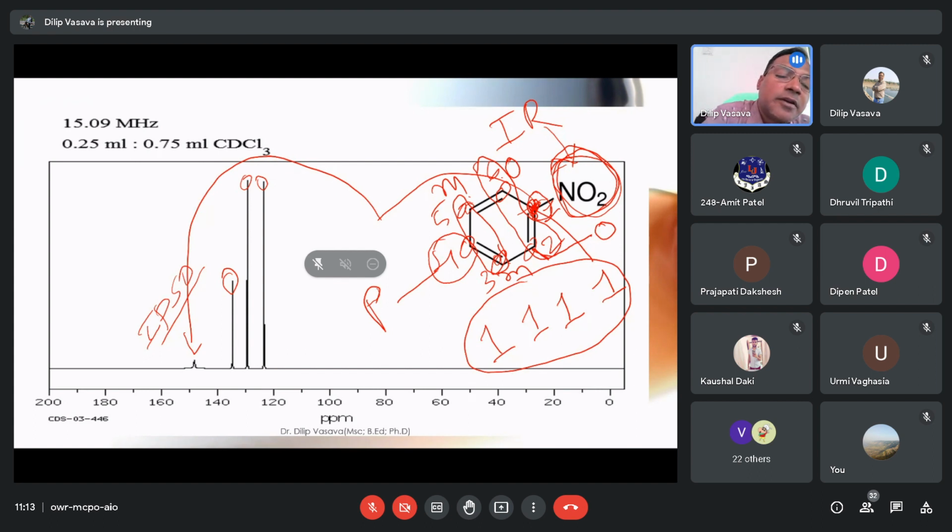Now in this also, if you are able to see, there is a black line, because two carbons are there, so it is overlapping. It is not clearly visible here in the instrument, but if you go for the stretching, expansion of the graph, you will get those 2 carbon atoms. So this is how the carbon spectra can look.